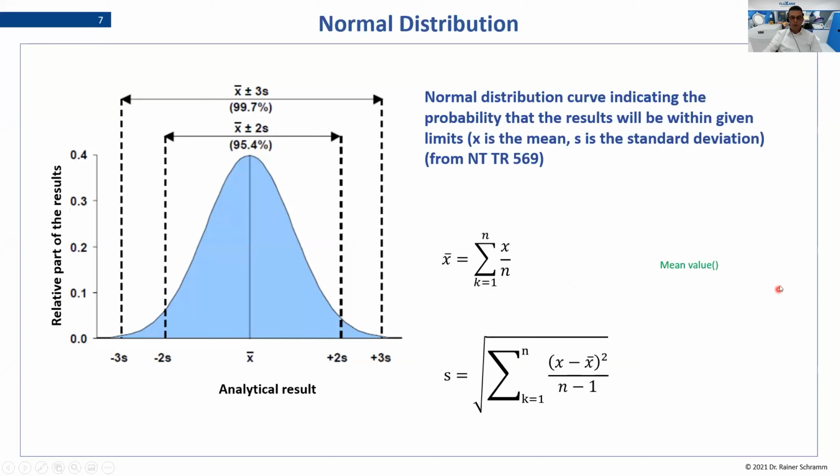So mean value is clear, but here on the standard deviation, you have to be careful that you really use the right function. It's either in the old versions, the STDEV, or in the newer versions, the STDEV.S. Don't use the n, because this would just make the division by n only, and in the laboratory we only have a limited number of values, so this would never be valid.